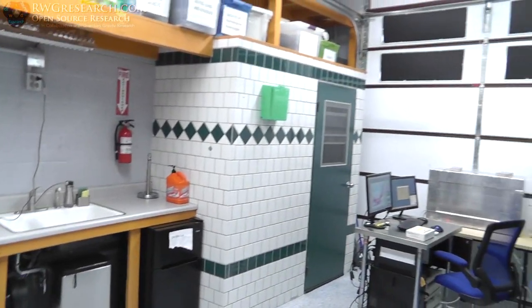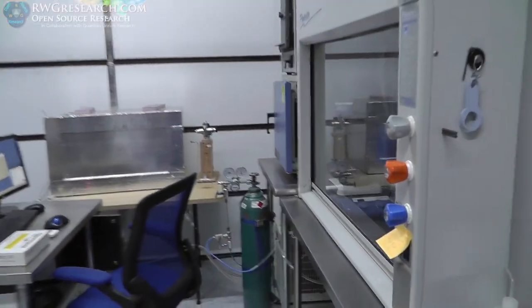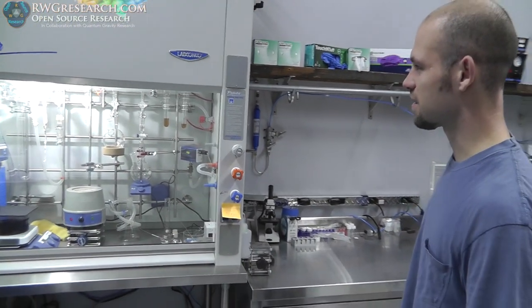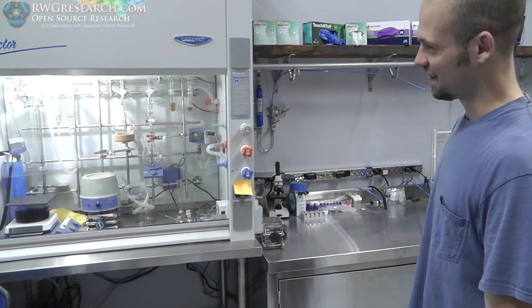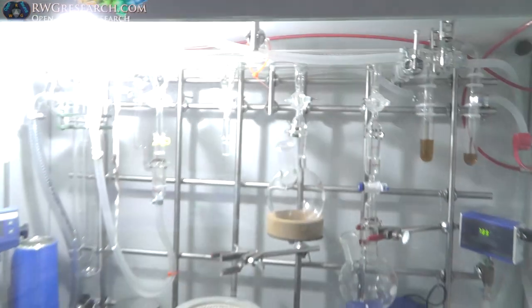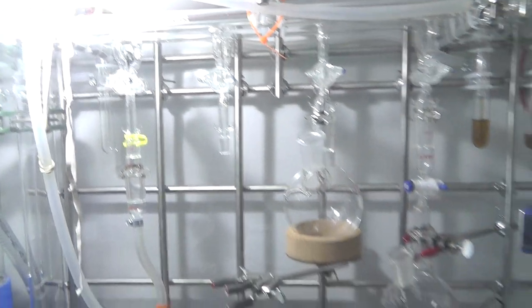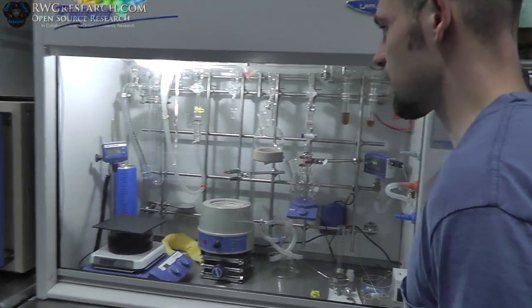Here it is. This is the lab. Got your glove box. Yep. Got this Schlenk line all built. Yeah, that's freaking awesome. Isn't that nice? Built that whole thing one piece at a time. It's all quartz? No, it's just borosilicate glass. But it's all vacuum-rated stuff and high purity stuff.